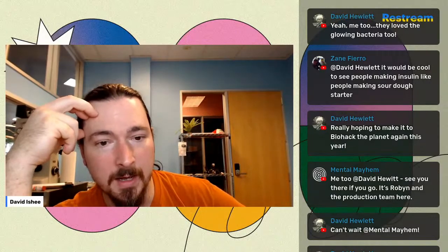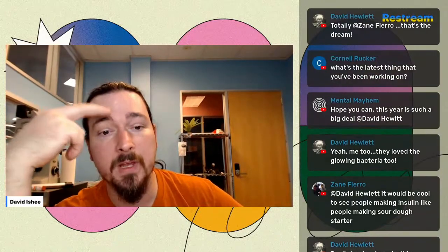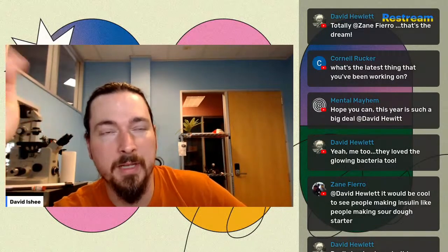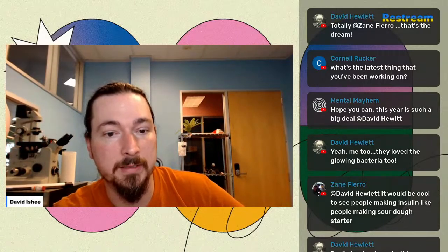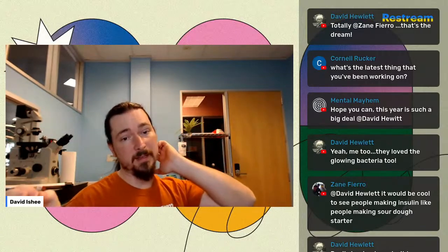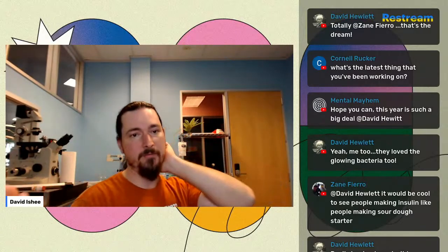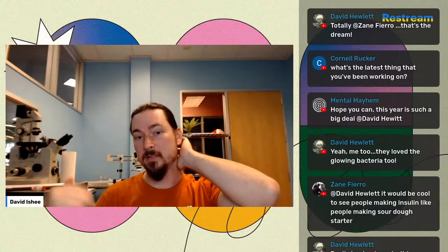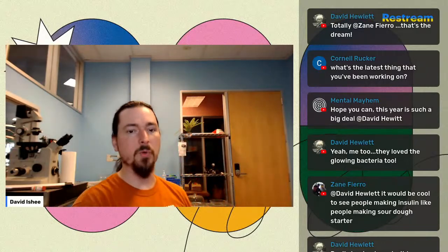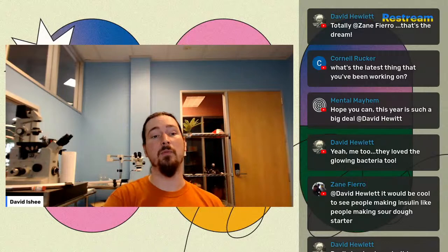But yeah, barring that, I'm trying to make a way to make tissue culture easier, like this agro infiltration, super easy protocol. You pour the plates, streak out the bacteria. The next day, the whole protocol takes 10 minutes, right? Super easy. But the original protocols that I was working with took days. It was a 3-day process and you needed various machines. So I spent months simplifying and finding out what you need and what you don't need. It turns out there's just a ton of stuff in the normal protocols that you don't necessarily have to have.